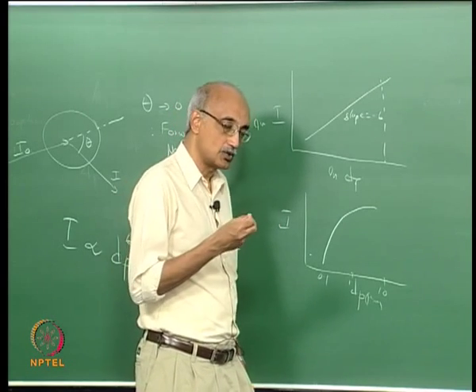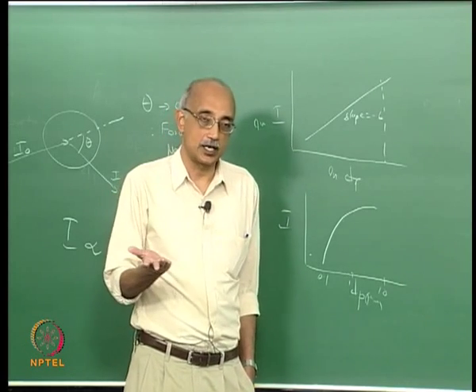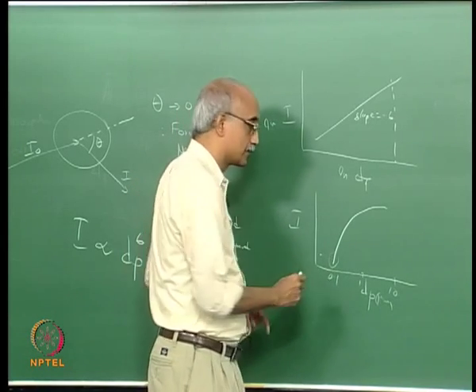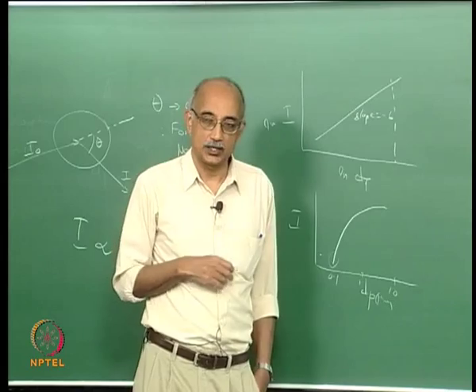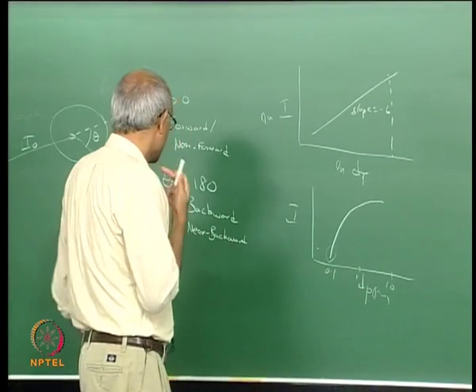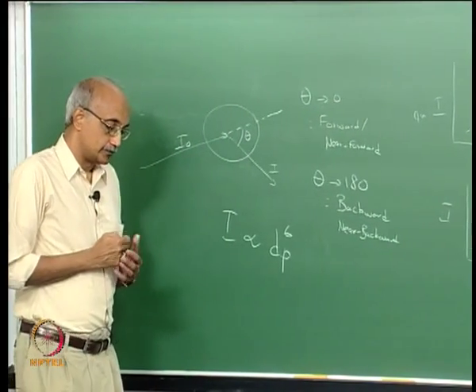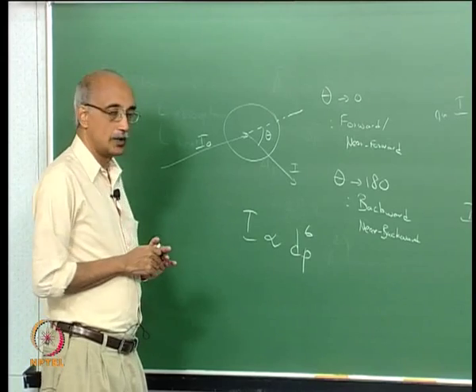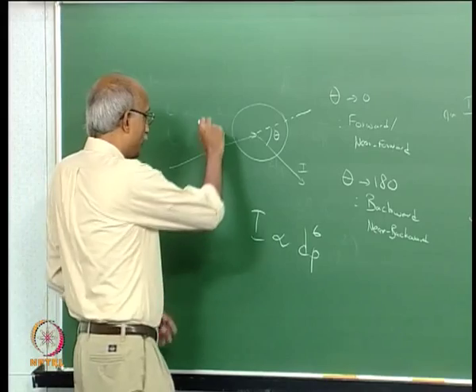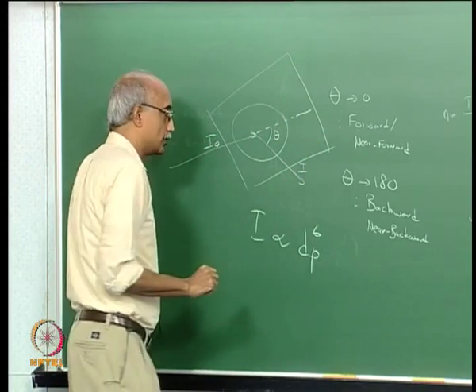So it's a challenge that you should think about. Let's say that you are stuck with light scattering techniques and you want to measure particles that are in this size range. How would you do it? It's just something that you can think over, and then we'll come back and talk about it later on. So going back to this chart that shows how light is scattered by a single spherical particle, we defined something called a scattering plane, which looks like this.